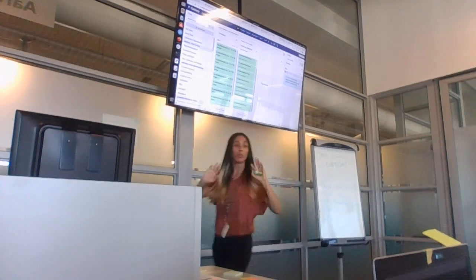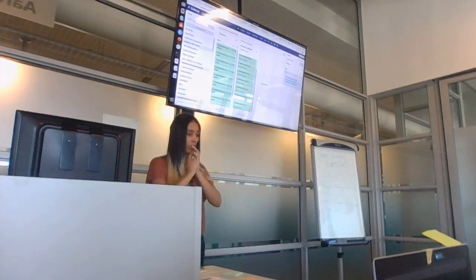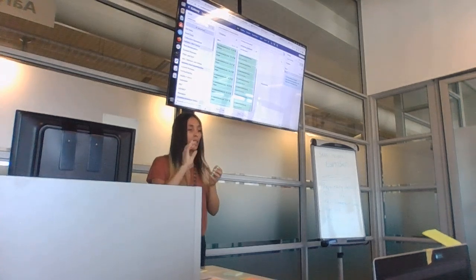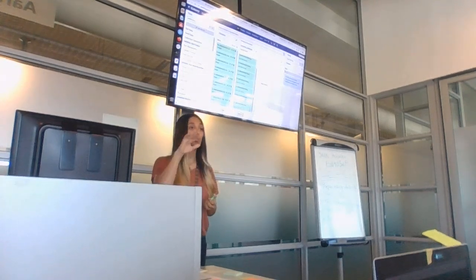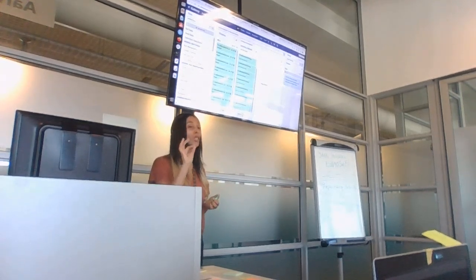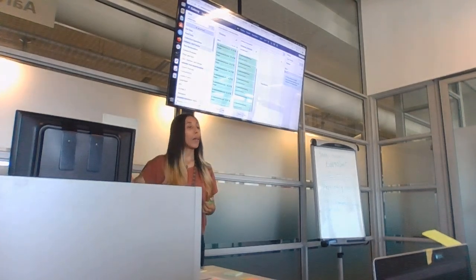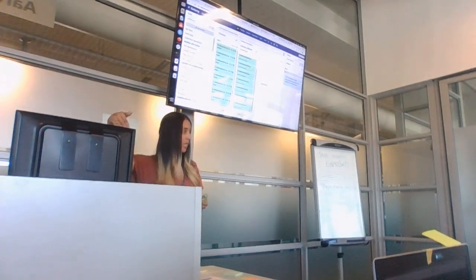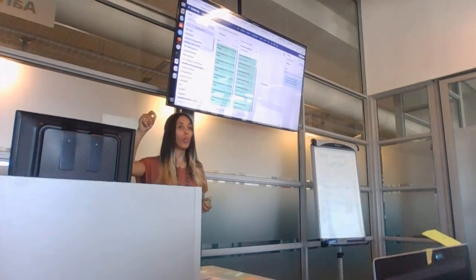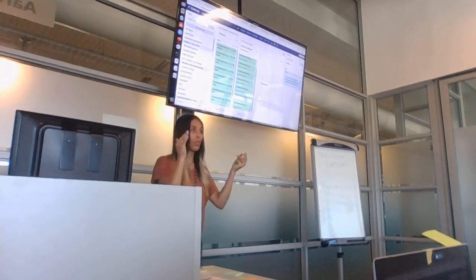What we are going to do, I'm going to explain quickly what we're doing. Oftentimes, when you have a data set on your computer and you want to do an analysis on there, you would reuse data in there to run a different analysis. You don't upload that file again to your computer. You just go to that directory where that data set is, and you copy it maybe over into a new file to do the analysis on there, or you may run it on it.